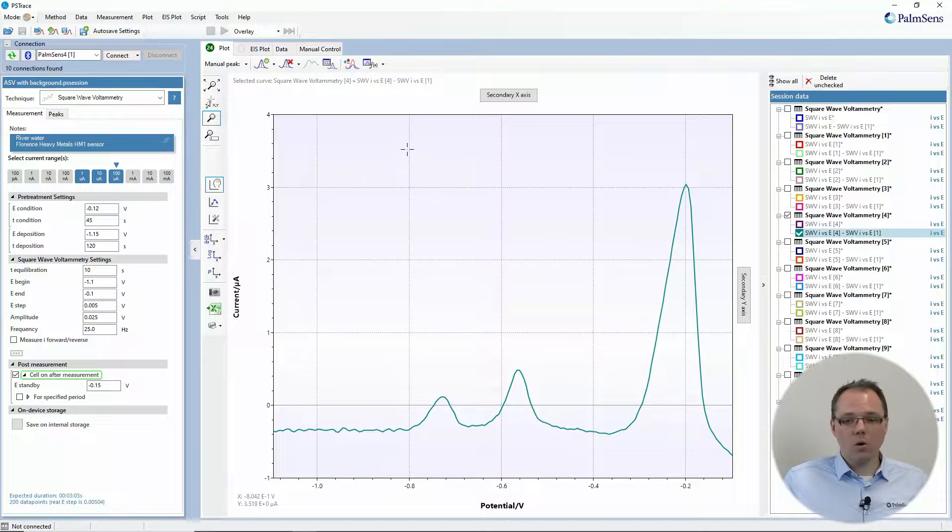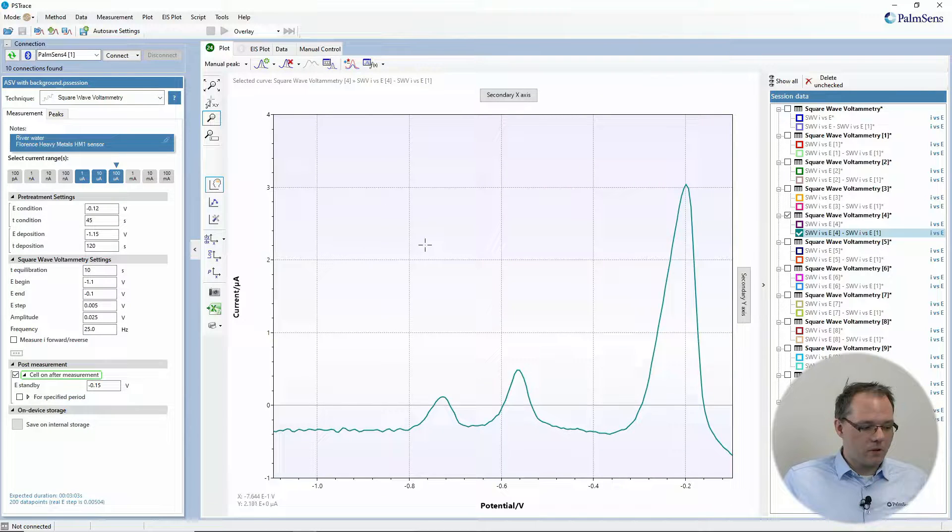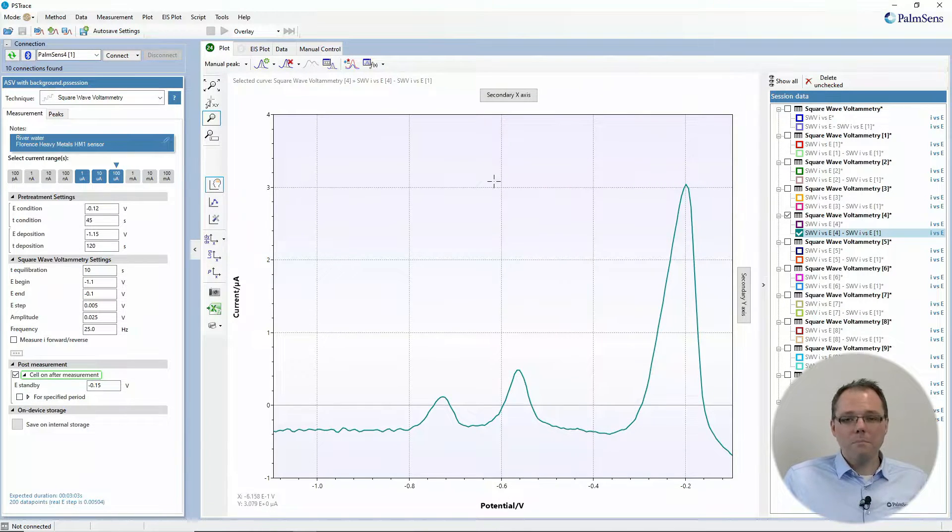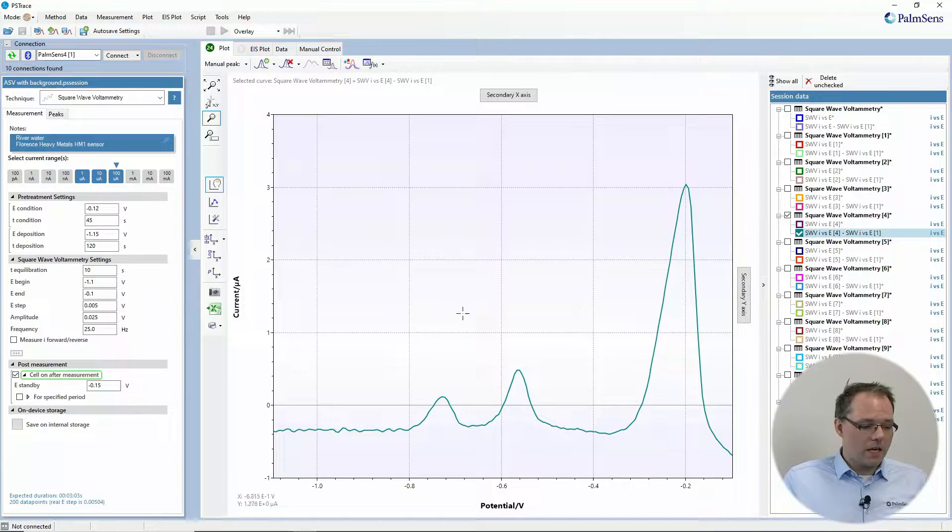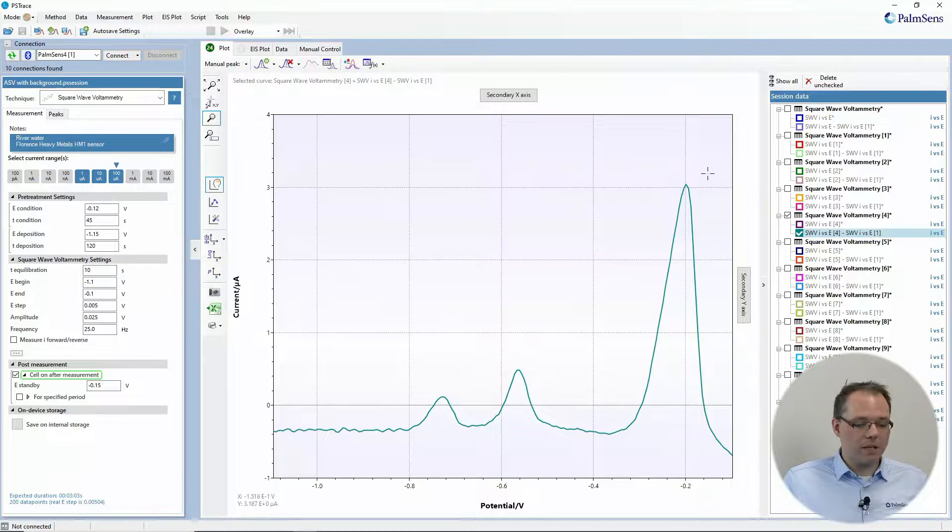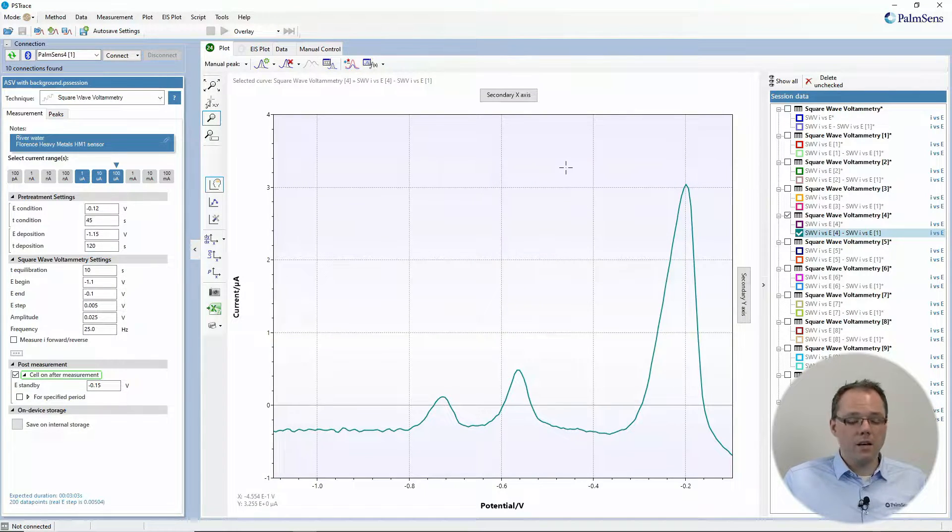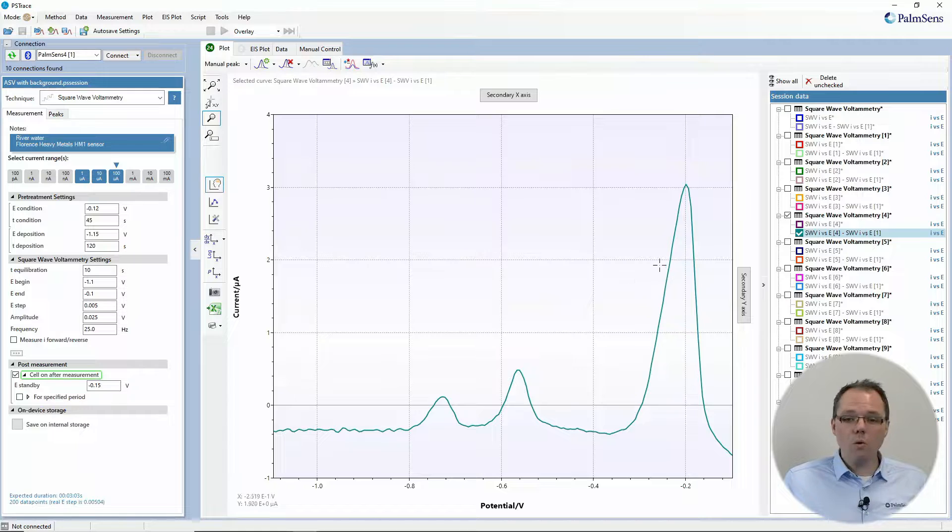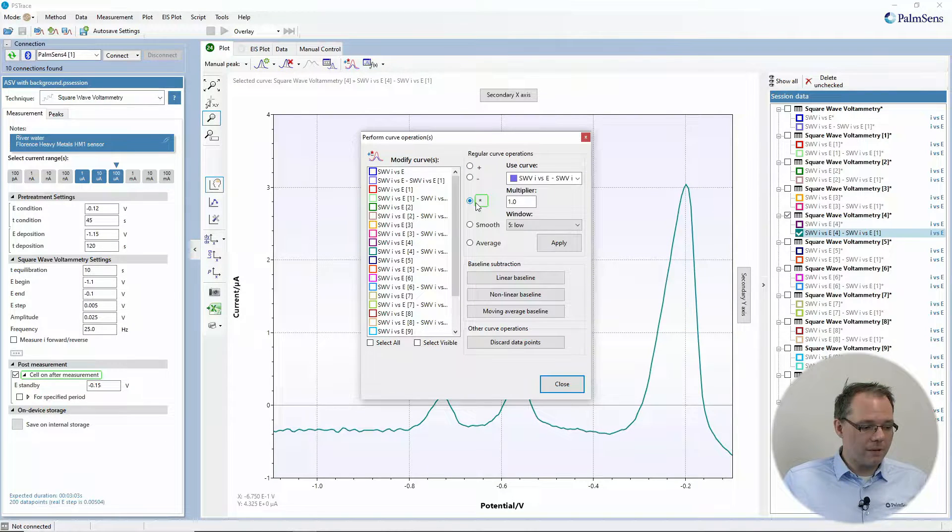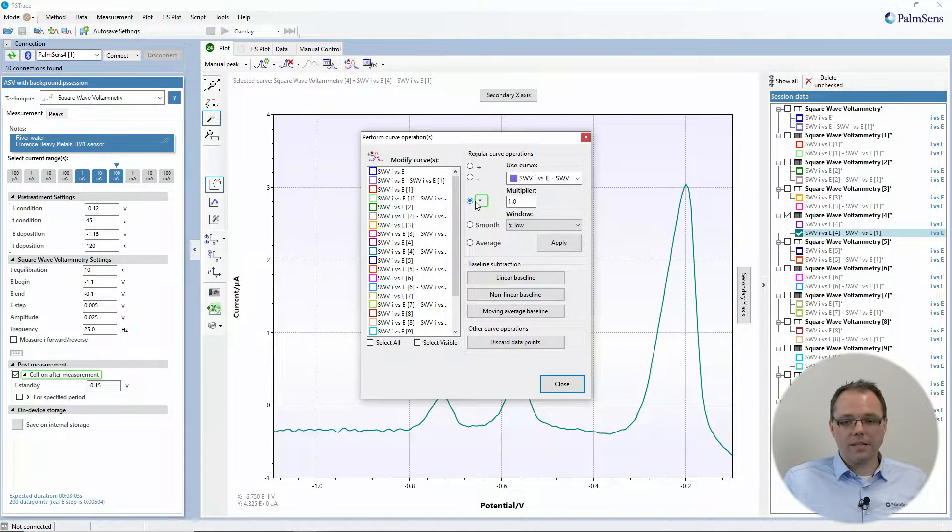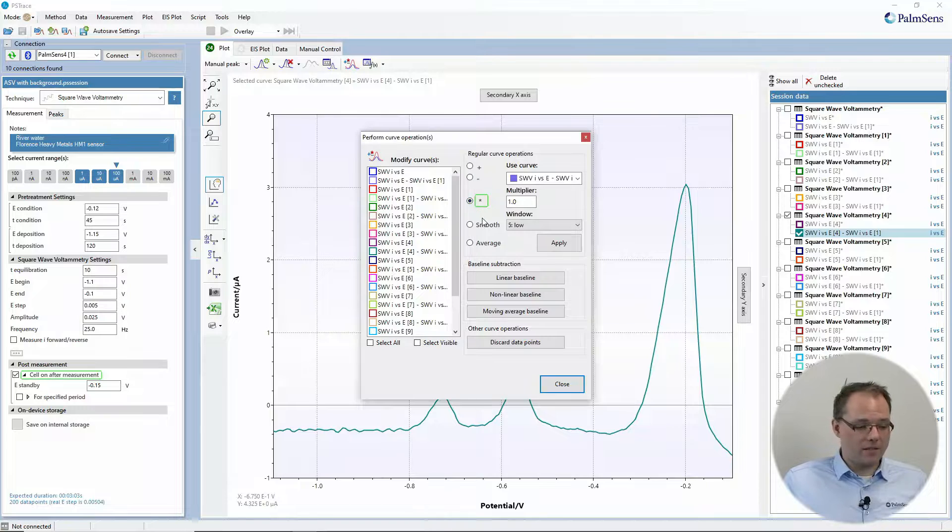What are other curve operations? So let's have a look at this curve. Maybe you're just interested in the relations between the relative intensities so you want to normalize your curves. So you can for example multiply or divide by a factor.